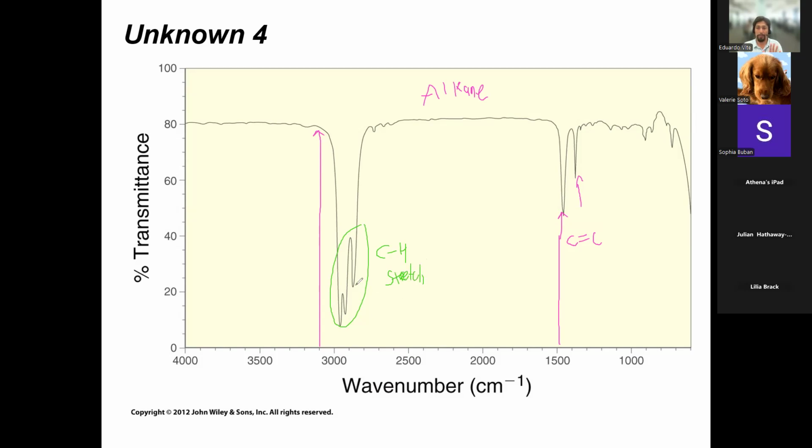And again, don't get confused because you're going to say, well, you just told me that this might be an aldehyde here. Right, but if you were expecting this to be an aldehyde, you should also see a corresponding carbonyl at 1700, and I don't see one. So even though it might look like an aldehyde, the fact that there's no carbonyl means it's not an aldehyde, right? If there's an aldehyde, you would see a carbonyl peak. So all we can make any claim about for sure is that this is just some sort of alkane. And sometimes that's just it. We need more information.